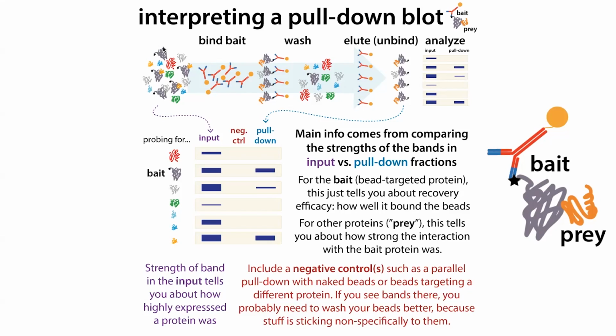Inside of cells, these proteins are often partitioned off into different places in the cell. There are various things where proteins that work together are kept together, and you have all sorts of things helping compartmentalize things inside of the cell. And then you break the cells open and make these all interact. So proteins are going to be seeing proteins that they don't normally see, or don't normally see in those concentrations.